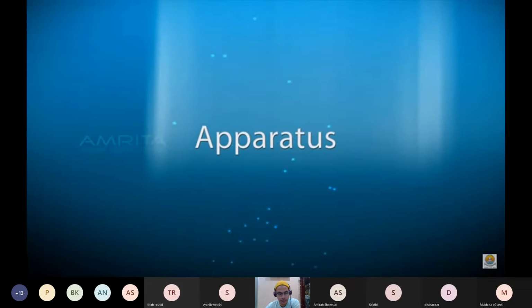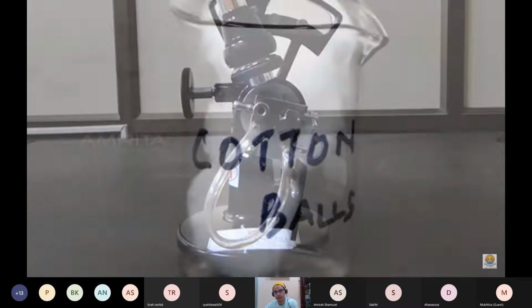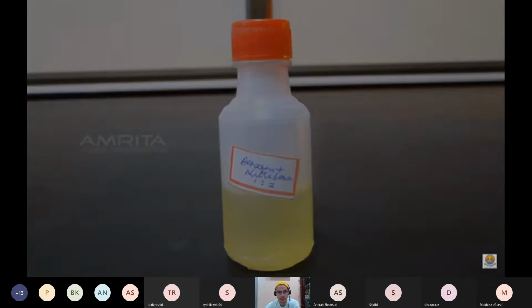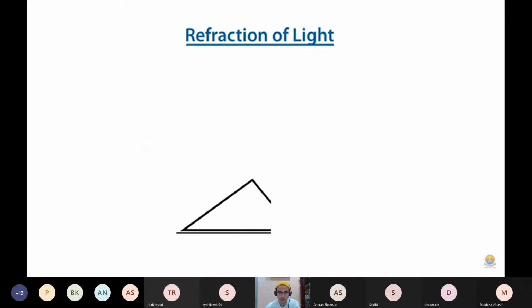So dalam the pharmaceutical industry, we use this test untuk identification test juga. Okay, kita guna test ni untuk kenal pasti bahan yang kita nak test tu. And usually the bahan adalah liquid.